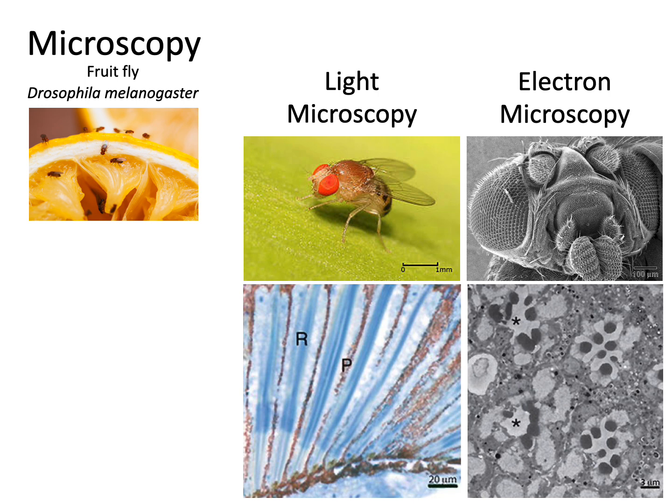And then the lower right is what we call transmission electron microscopy. And just like to the lower left, light is going through that ommatidia specimen, to the lower right, electrons are going through that ommatidia specimen. So both of them require a very thin section, not always, but oftentimes preserved.